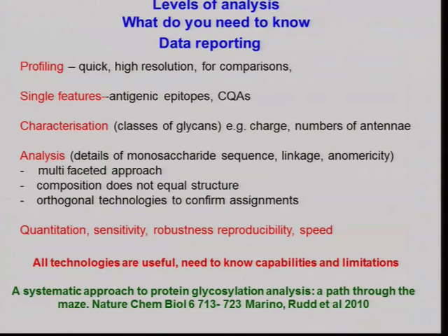Do you just want to profile? Do you just want to look at all the EPOs on the market and see how different the glycosylation profiles are from each other? In that case, you don't want a detailed analysis, you just want a quick release, you want a label or something, you want a high resolution technology, and you just want to be able to see just a big picture of how things are different.